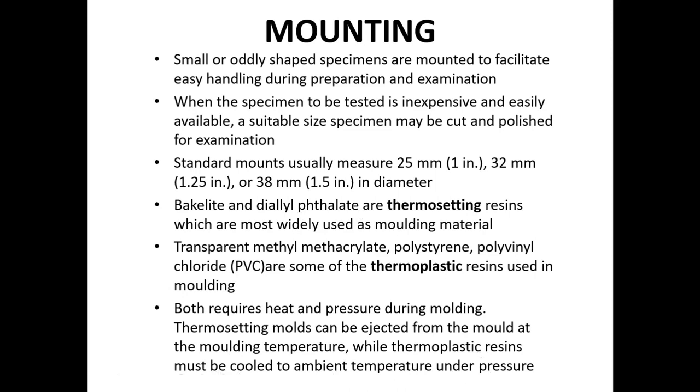You have to first take a material and it is to be heated at a required temperature that may lead to plastic deformation of that material, and at ambient temperature under pressure we can mount the material into the mount. So these are the different materials that can be used as a mount, which comes under thermoplastic resins.